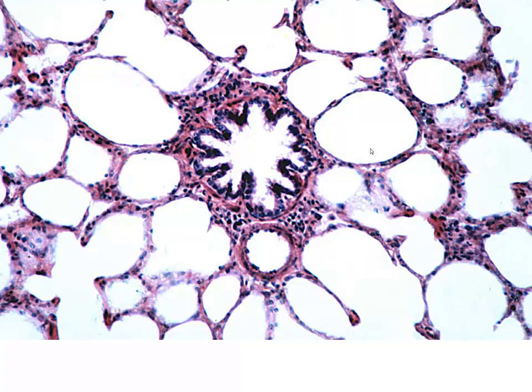Now, at higher magnification, we can absolutely see that we have our mucosal lining, and the cells are getting shorter and shorter, not as much pseudostratified now. Now we're more cuboidal to columnar. We can see our spiraling smooth muscle still on the outside. We don't have any cartilage. These are going to be our alveoli that are surrounding this. Here we have part of the arterial system within the lung itself.